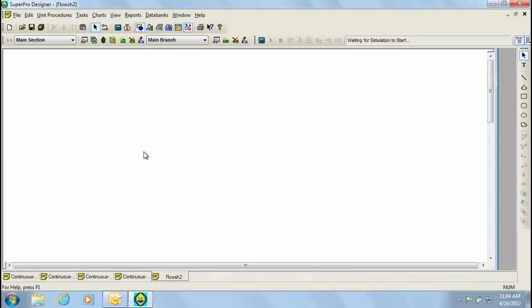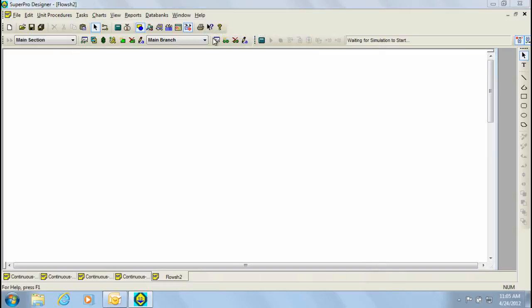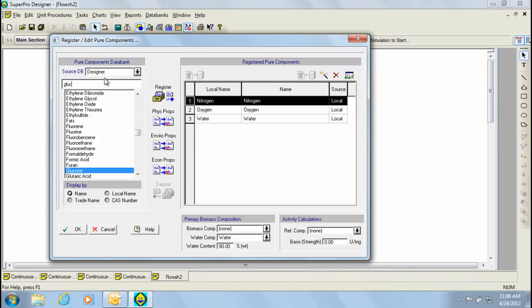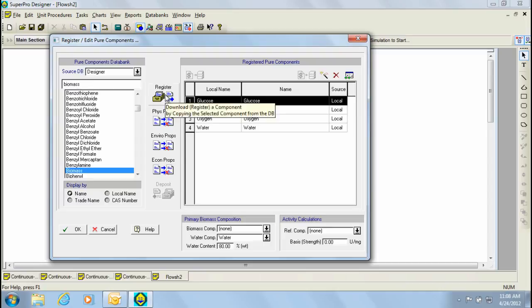This brings us to the main process flowsheet area. The first step to begin this model is to register the pure components which are going to be used. For that, let's select the register pure components option within the tasks menu. Through this window, we can register the components we're going to use. Using the designer databank, I can search for glucose and biomass and register them to my model file. To register, I can either double click on the component or click on the register button.